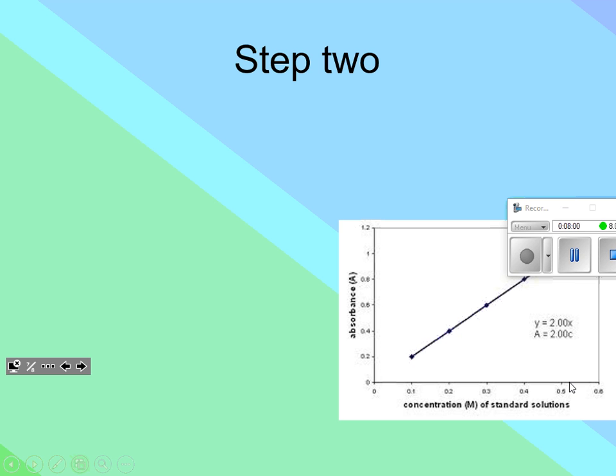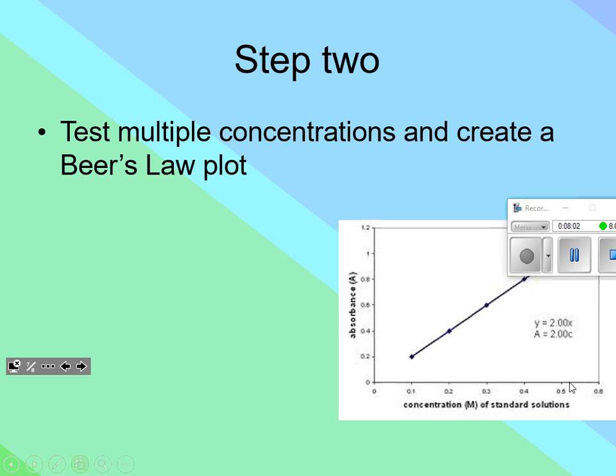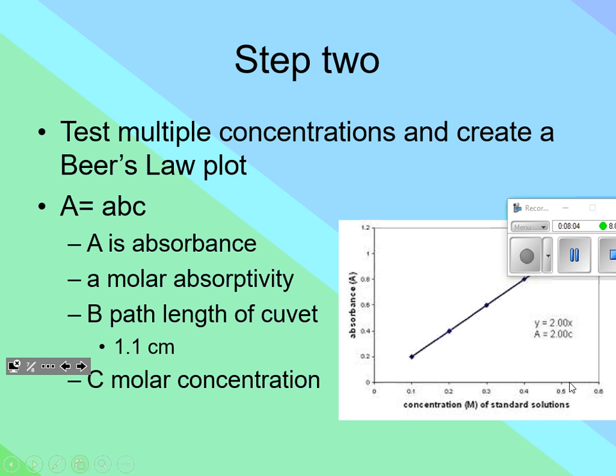If we get done with day one, next class, we're going to create what's called a Beer's Law plot, which is going to be hopefully a fairly straight line, measuring concentration versus absorbance. So once we have known values down, we can take an absorbance of an unknown thing and kind of plot it into our equation for our line and solve for our concentration. Now I can go over this again before day two, but I wanted you to be aware of this.